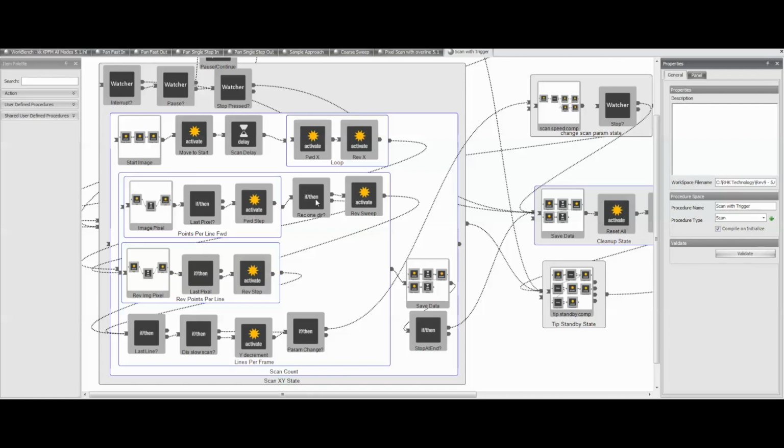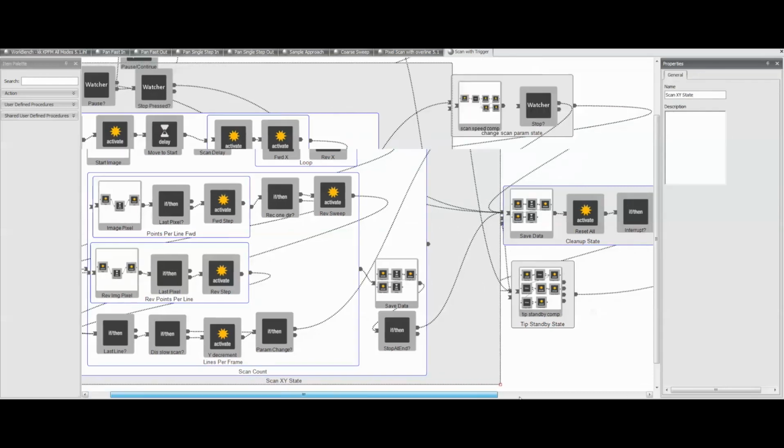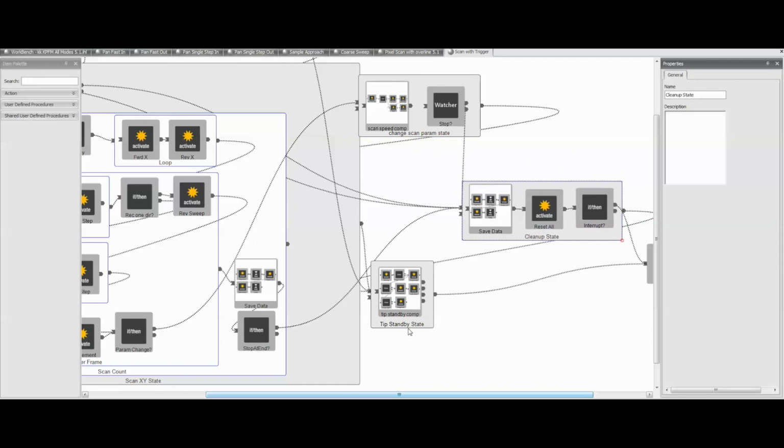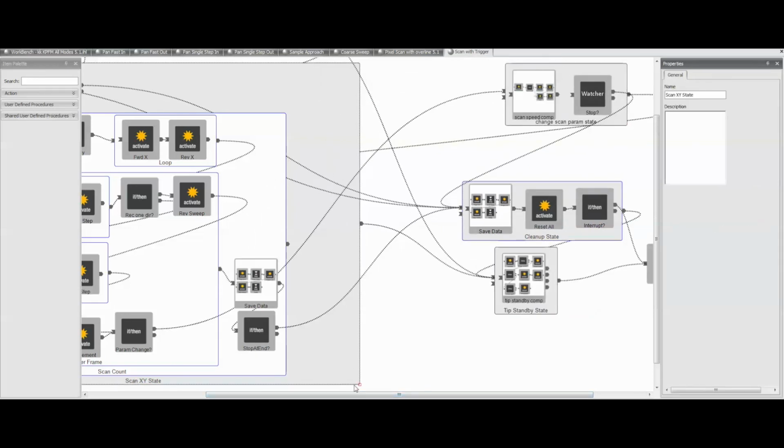Or, if the user happens to have record one direction enabled, it will do a solid sweep back from the end of the scan line to the beginning of the scan line before moving down, but it won't stop at each pixel. So first thing we need to do is make a little bit of room here. Pardon the mess, I'll just make it real messy to start, and I'll clean it up later.